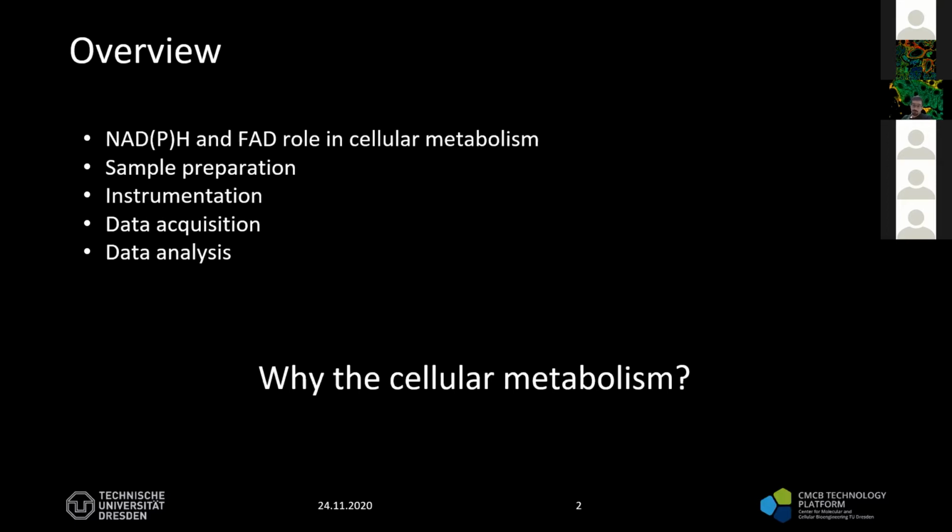That's the main reason we would like to have a way to assess cellular metabolism, specifically in tissues. In cells, there are other alternatives, established methods, which are, I would say, relatively slow to implement and to export data from and analyze. But when it comes to tissue or in vivo, it's more tricky. And we would like to address this using FLIM today.